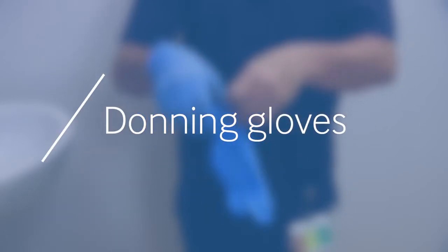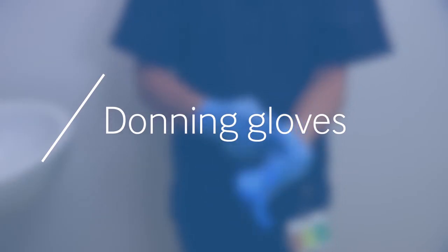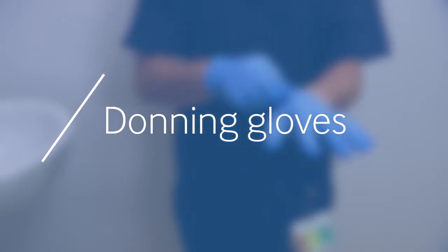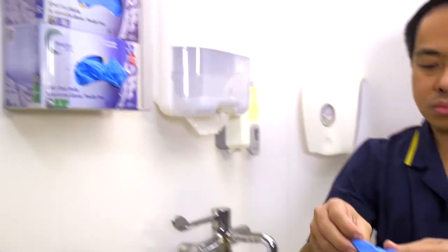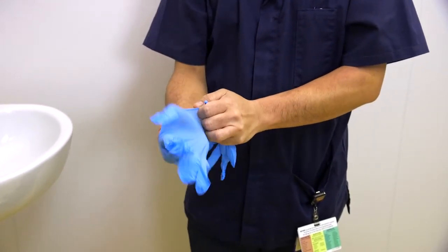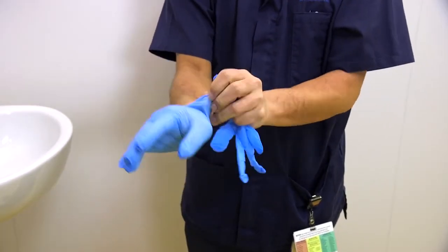Gloves are an important part of personal protective equipment. They protect the wearer from any infection the patients may have, and they will also help to protect vulnerable patients from the carer. Remove gloves from the box, or open a pack if they are sterile. Place hands into the gloves, ensuring they are the correct size and a good fit.